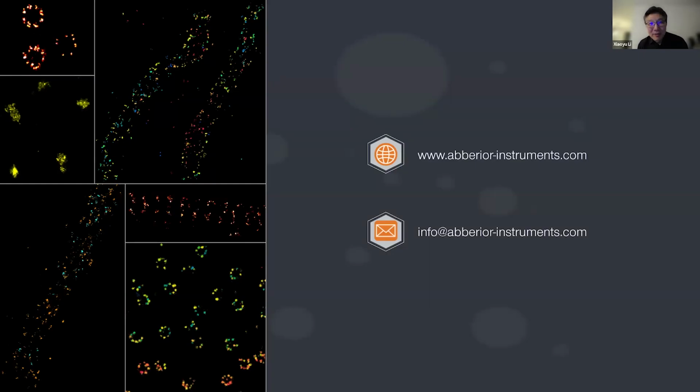Yeah. So I do not have a lot of published papers because this technology is kind of new, but I know a lot of our customers are sitting together with us to do the exosome work. Especially the labeling is very important. Normally we use primary antibody and secondary antibody, the antibody size is 15 to 20 nanometer. The whole labeling complex is 30 to 40 nanometer, while our resolution of the MIRAVA is 20 to 30 nanometer. So you have to make the labeling complex even smaller.